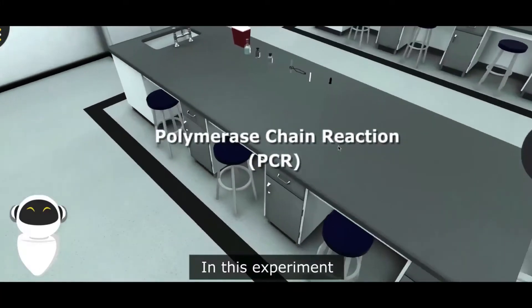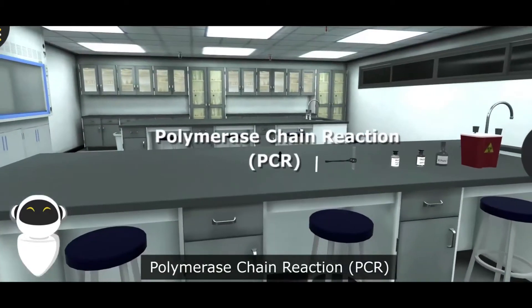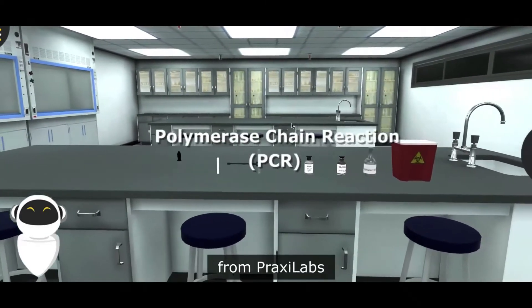In this experiment, we'll carry out several steps to complete the conventional polymerase chain reaction, PCR, using 3D Biology Virtual Lab from Praxylabs.